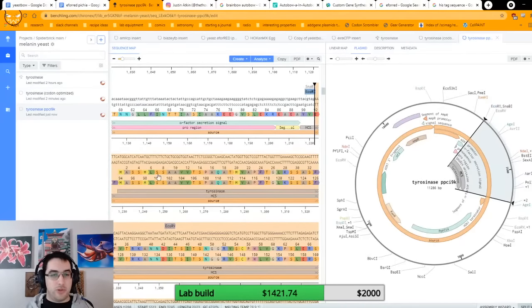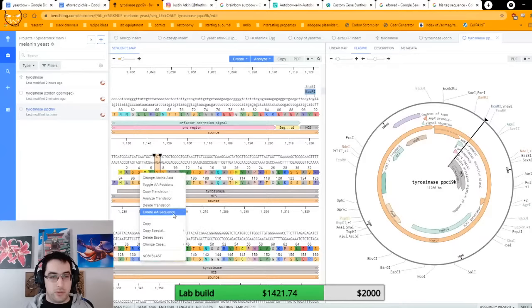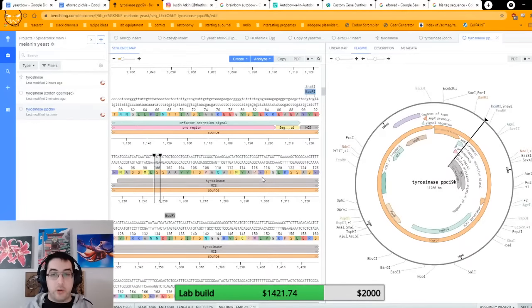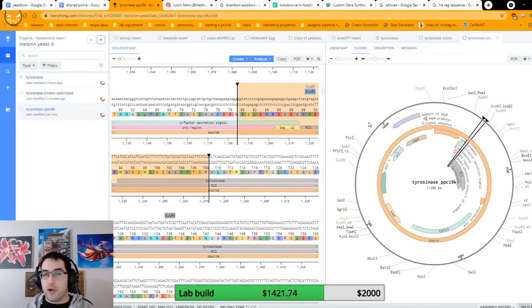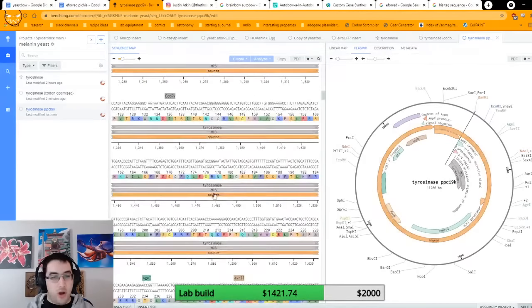And now you shall see, I can get rid of this translation. No, I don't want to delete the bases. I just want to delete the translation. Where'd it go? There it is. Cool. So now you can see that when I pasted it in, the sequence maintained exactly how it's supposed to. It's perfect continuity, which means that from the start of the protein all the way to the end, it will be produced properly. This is very good.